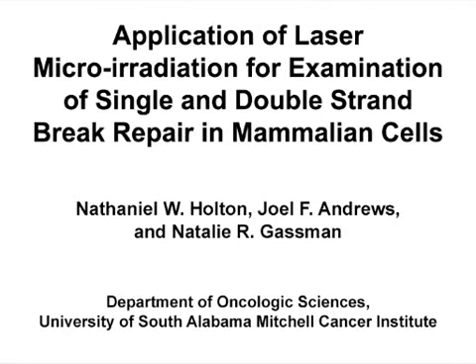The overall goal of this procedure is to induce DNA damage in a subnuclear region of a cell using a confocal fluorescent microscopy laser. This method can help answer key questions of DNA repair, such as how proteins are recruited and retained at sites of DNA damage. The main advantage of this technique is that it allows for real-time visualization of the protein of interest, so that a profile of recruitment and retention can be built.